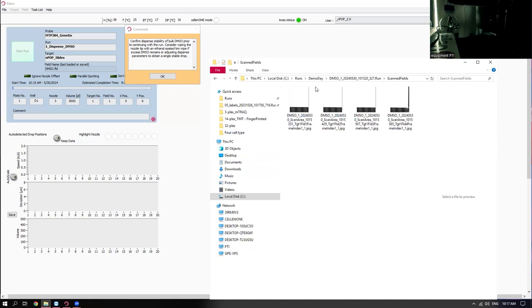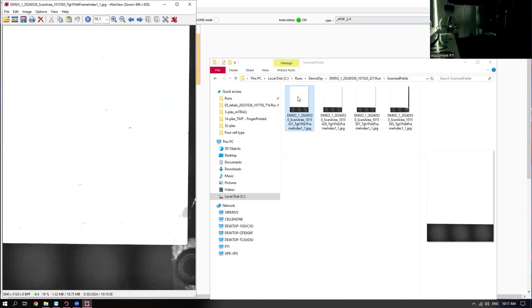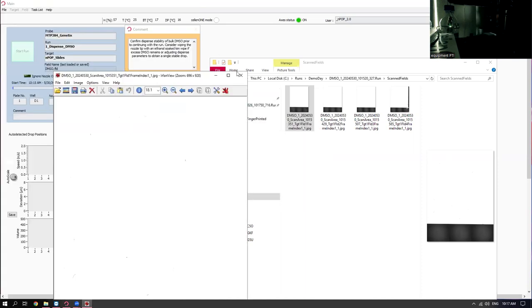So we just finished the very first part of the prep, which is scanning of these fields. We get these background images of the slide so that as we go through the process, if we see something that's abnormal, we can trace it back to some event, some particle, some something. These are just the slide image from above with our coaxial camera.